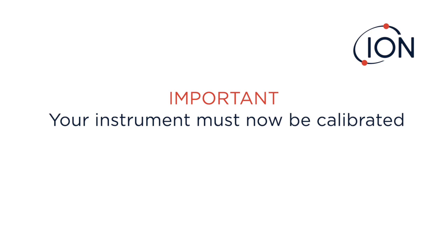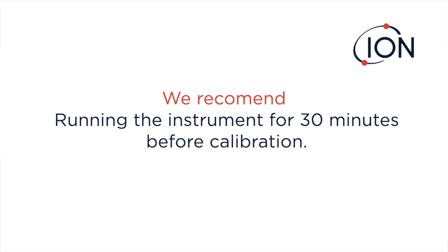After cleaning the lamp, calibration will be required. We would recommend running the assembled instrument for approximately 30 minutes prior to carrying out calibration post lamp maintenance.